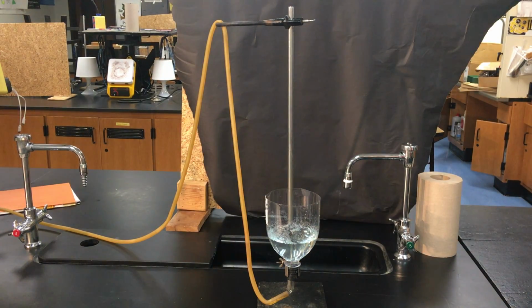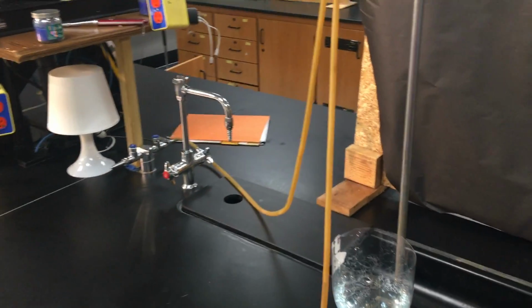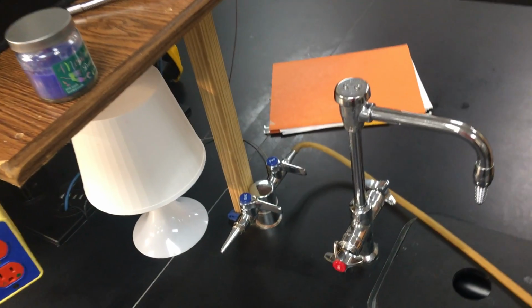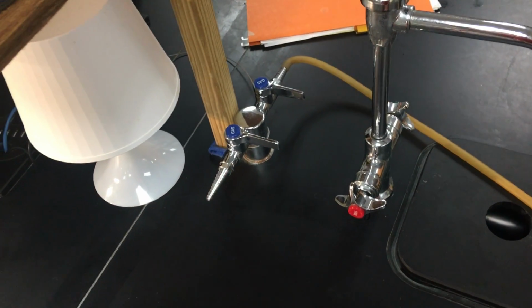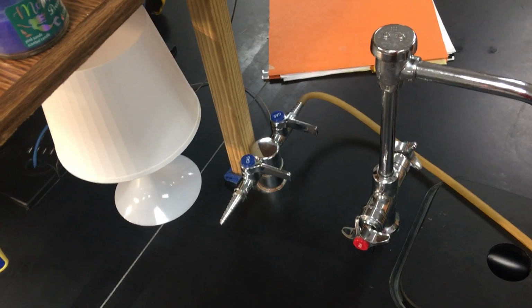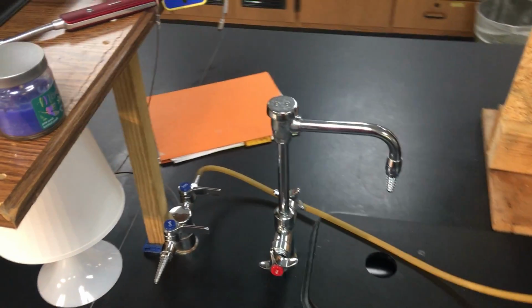We're going to do some demos. I'm up at school because I want to do a demo that I just cannot do at home because of the equipment limitations. But right here in my classroom we have the gas jets. These are the same gas jets that we would use if we were at school. Natural gas or methane comes out of these gas jets and we use them for Bunsen burners.